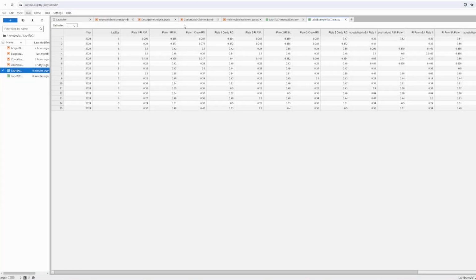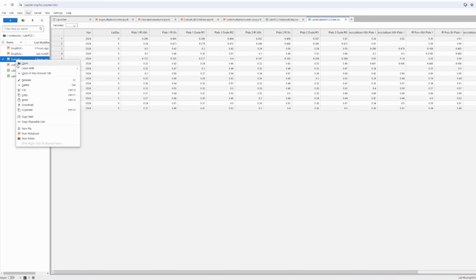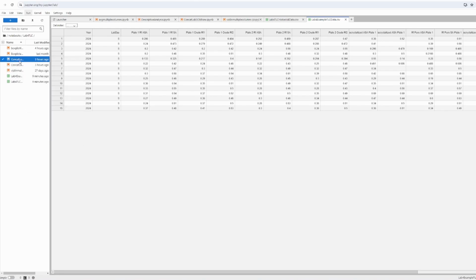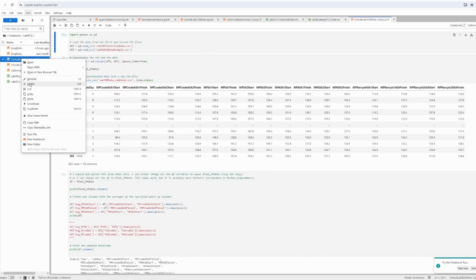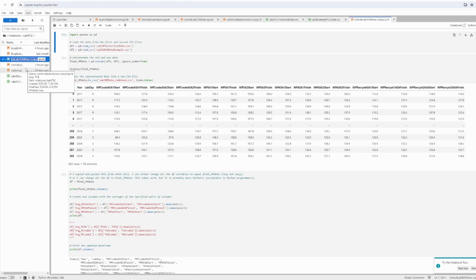So to make life easy on ourselves, we're just going to take this file and copy it, so then we can manipulate it with all of the variables that we need. So I'm going to take this one here, right click, and duplicate. And so we'll get it, and it now says copy on it right there. I'm going to take that file, it's the same one, and I'm going to rename this. We're going to call this TLC, actually lab 4. We'll call it analysis. Let's see how that goes for now. And so we've got our new name.